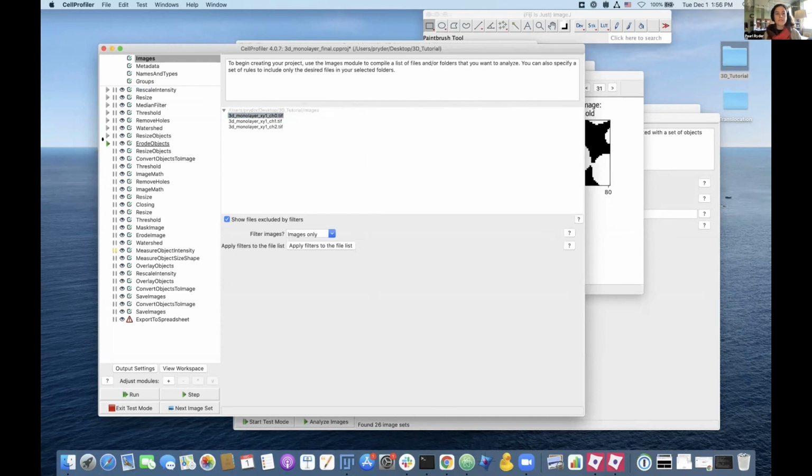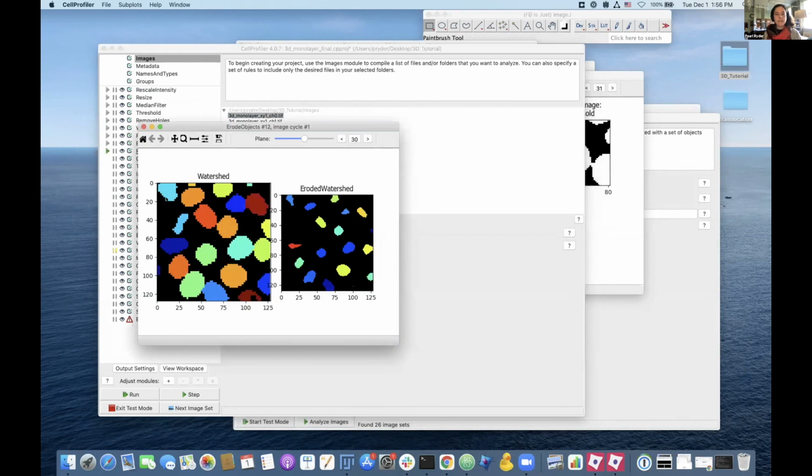The first step to finding the cells is that we have to create seeds for them using the nuclear objects. And we're going to start by shrinking the nuclei to make them a little bit more seed-like. So we go ahead and do that on the small nuclei. We shrink them a bit more, and now they look a little bit more like seeds.